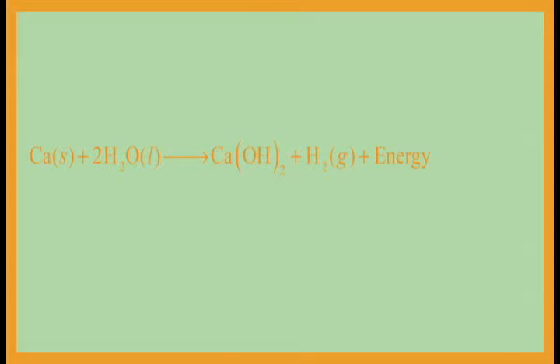This reaction is extremely exothermic. Therefore, we can add an energy term to the products side of the reaction.